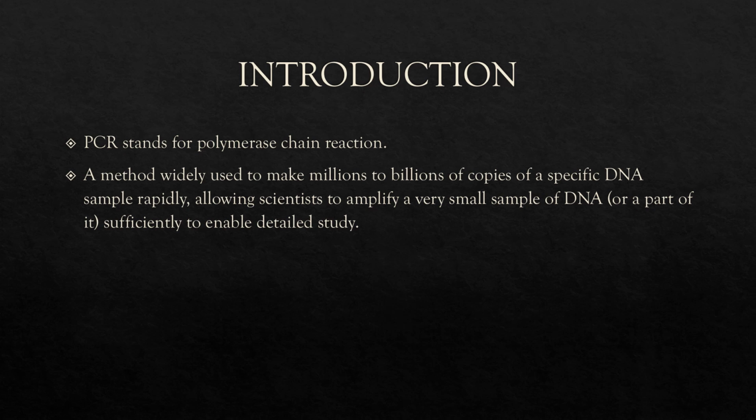So what is PCR? PCR basically stands for polymerase chain reaction. You might have studied it in biochemistry as well as during your 12th standard. It is a method that is widely used to create billions of copies of a specific type of DNA. This method enables a detailed study using a very small fragment of DNA.